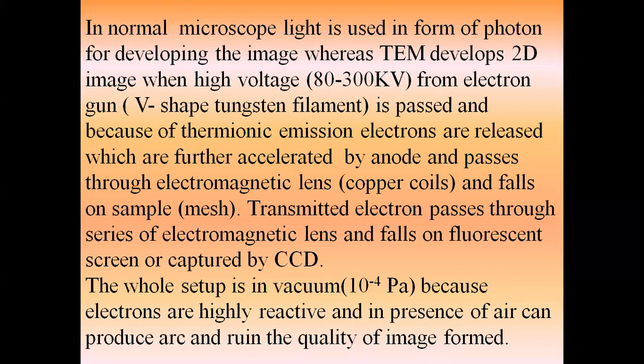As a result, the quality of your image will be degraded. You will not get a very clear picture. So the whole setup is made inside the vacuum to avoid such disturbances or distortions. So the setup is inside the vacuum.